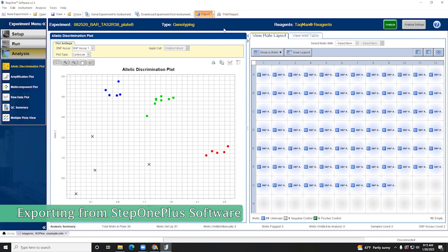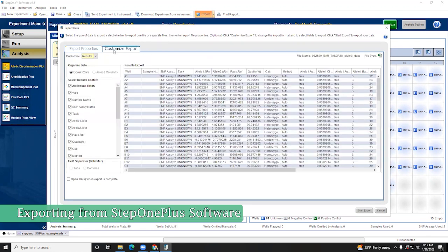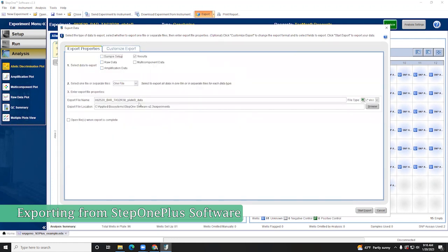But it also could be the difference in the machinery and whether or not it had been recently calibrated, so they might just not be as tight or clean as we might like. Again, this machine is older and it does actually get a lot of use, so I may not have calibrated it recently, especially for the VIC-FAM dyes that we use in SNP genotyping.